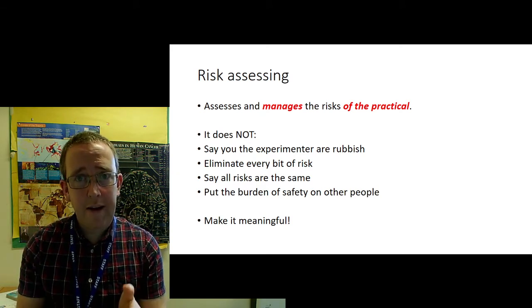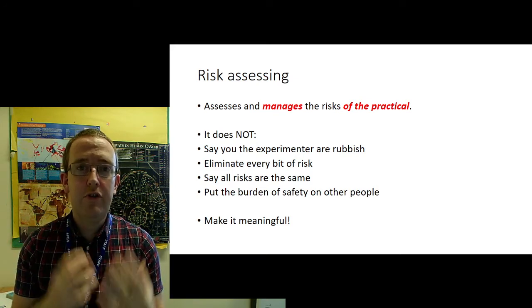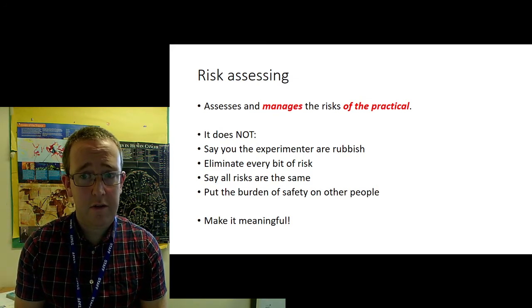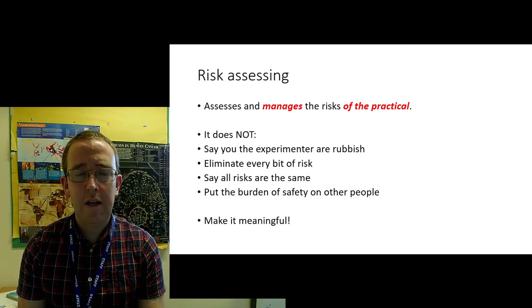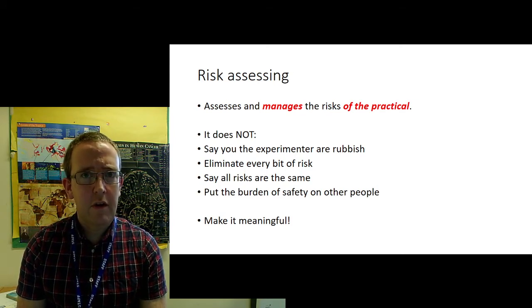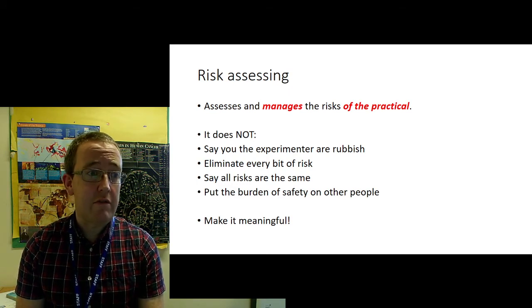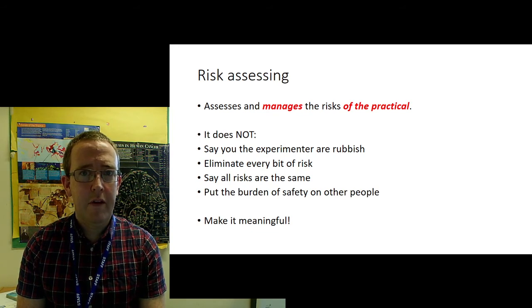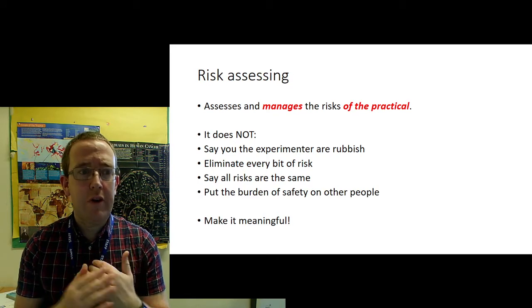It's about managing risk. Okay, it's about the idea of what you do reasonably to adjust for things that actually are risks. Okay, you must not also say that all risks are the same. There's obviously this tendency to come up with as many risks as you possibly can because that's a better risk assessment. No, I mean the risk of a meteor hitting the lab while you're working in there is not the same as the risk of you breaking a test tube. Okay, the risk of breaking a test tube is much higher. The consequences of breaking a test tube aren't really very significant. You just clean it up and move on, right? So not all risks are the same, and you've got to actually put them in some kind of order.